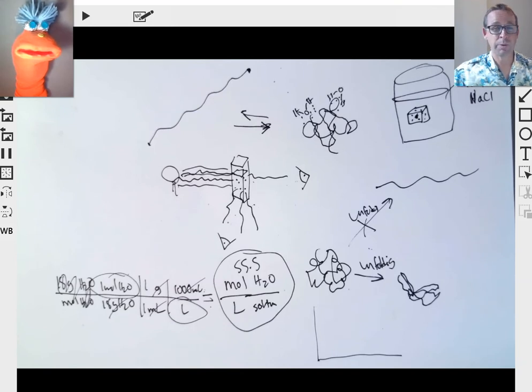Okay, so tryptophan, tyrosine, and phenylalanine, those are our major fluorescent contributors, right? They can absorb energy as well.